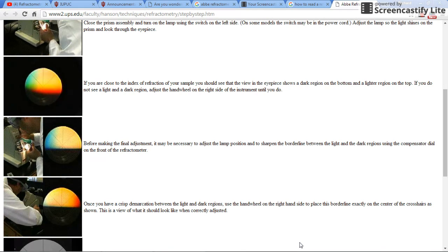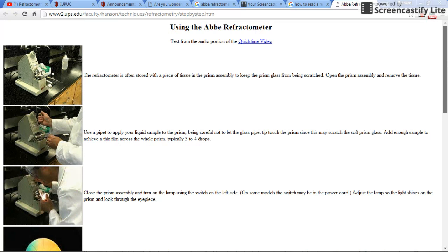Refractive index is essentially that physics term of when light goes through different materials, light gets bent differently. So every substance has a refractive index based upon what it is.